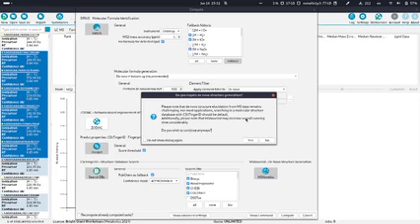And if you now also do MS Novelist, then you usually have 50 more candidates per molecular formula, which sums up a lot over a complete project space. So it can make your project space a few gigabytes larger. So it's recommended to not use MS Novelist on all compounds, but really on purpose, if you think that a certain compound you're interested in is not correctly annotated or is not contained in PubChem or any other structure database. Yeah, so let's just turn it off for now.